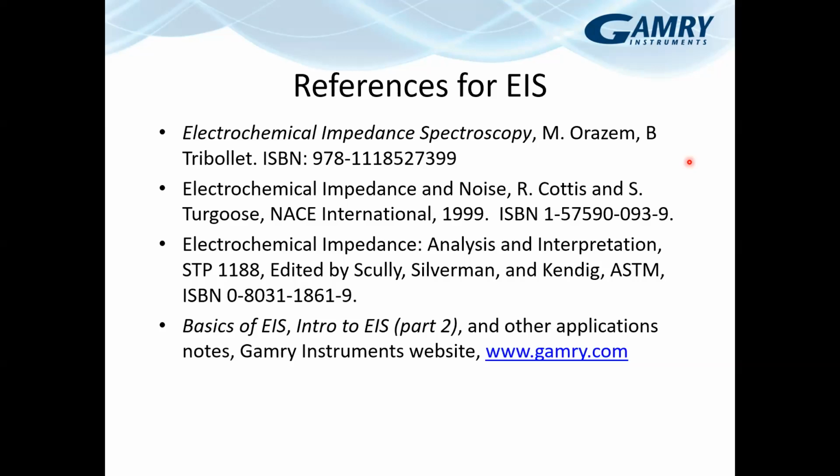It takes a little bit more to understand what you're doing with EIS than it does to understand polarization resistance. It's similar to understanding cyclic voltammetry in terms of the amount of information that you're getting out of it, for people familiar with that. I think Chris said earlier at the beginning that we're hoping to maybe take this forward so that we can give you more specific, defined ideas about what to do with this. But for this talk, this introduction, that is what EIS is.